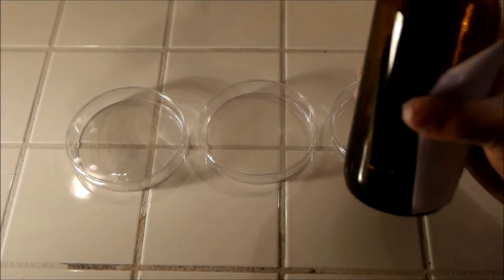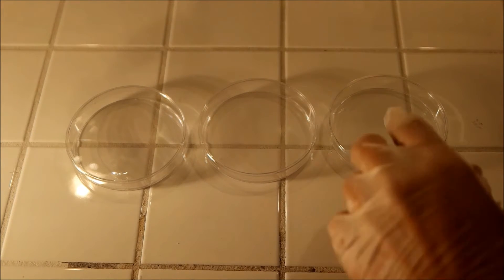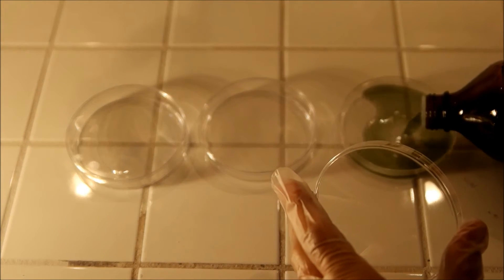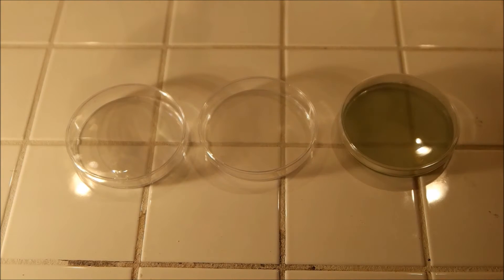After the microwave you can just pour your medium into the Petri dishes. Let it cool for around a minute. It has this green color because of the Bromothymol Blue.